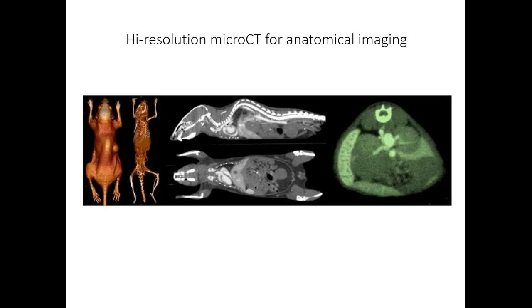So I hope you got a sense from looking at those two videos what the capabilities are, or at least be able to appreciate the capabilities of imaging CT alone. Looking at anatomy alone, there's quite a bit of information that you can get out of just simply looking at structure. There are users, for example, that are interested in looking at vascular calcification of different tissues, and CT would be fantastic for that because of that level of density coming from these calcified regions.